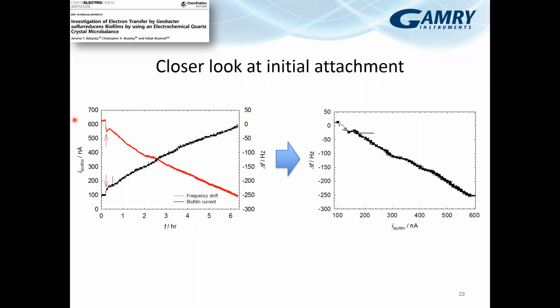It doesn't actually displace vertically, like maybe a tuning fork would. So the QCM, as you would buy it, is fairly insensitive to vibrations. If you have to isolate it, you can just put it on a granite slab, and that tends to arrest most of the vibration you get from buildings.